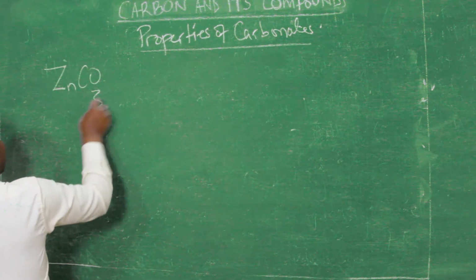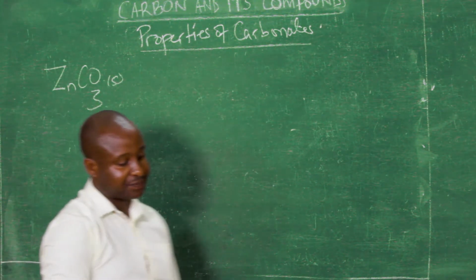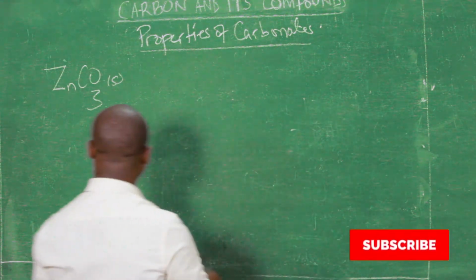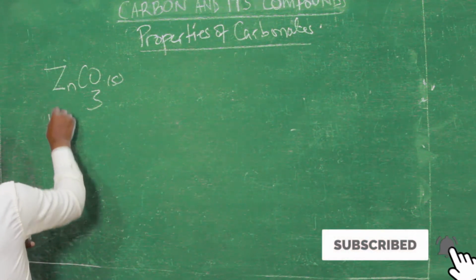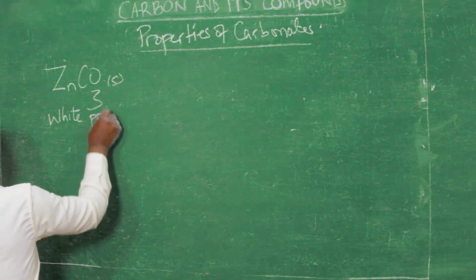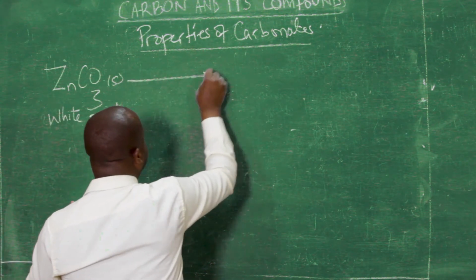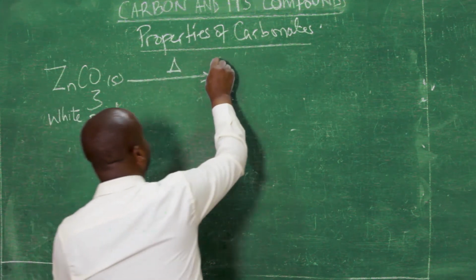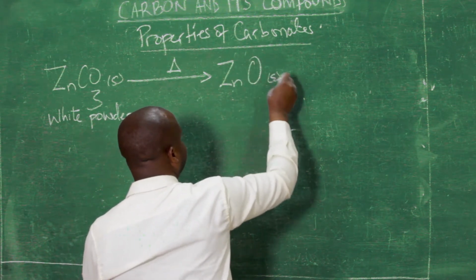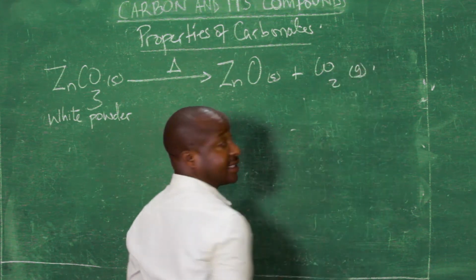Zinc carbonate, which is a white powder, is affected by heat to give zinc oxide and carbon dioxide gas.